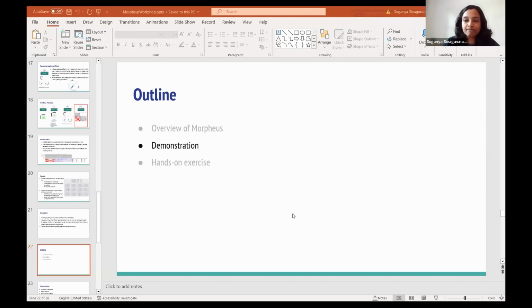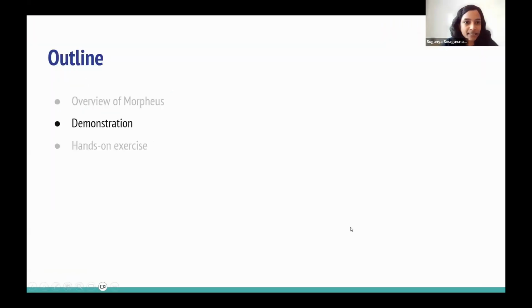I will just share the slides to give details about the workshop, and then we can go into the breakout rooms to start working on it. Let me give you an introduction to the data set that we are going to be using for the workshop. Do you see my screen, the slides? Yes.